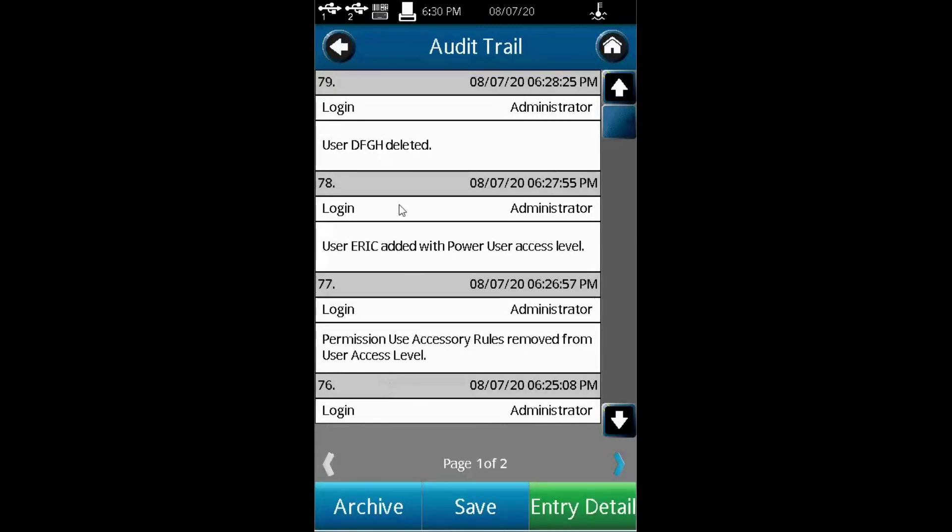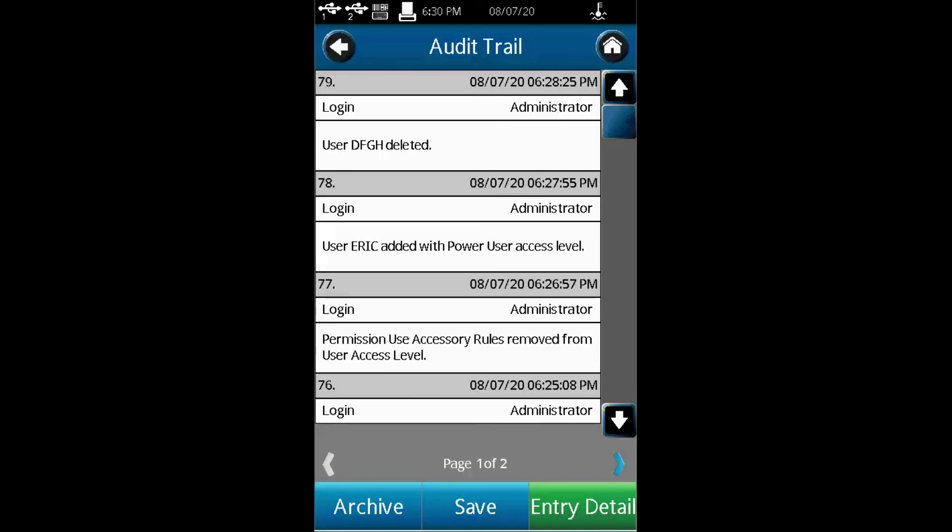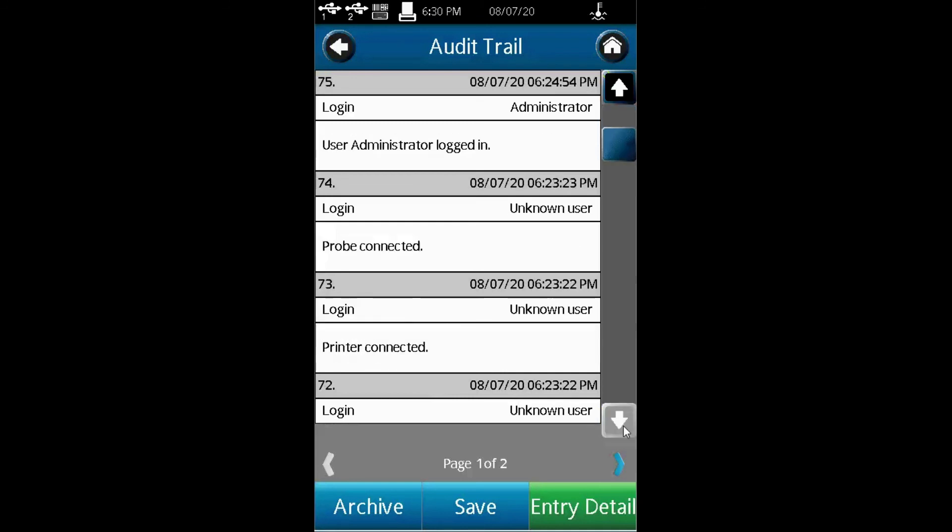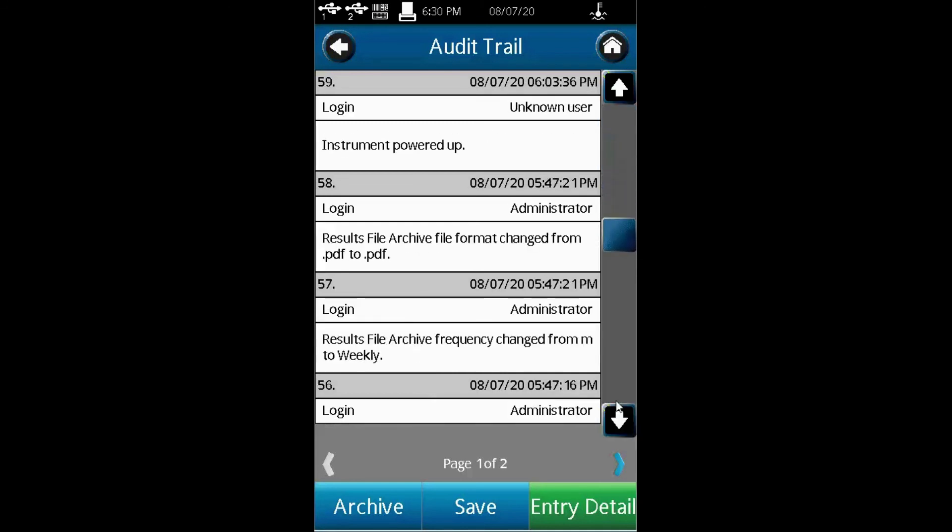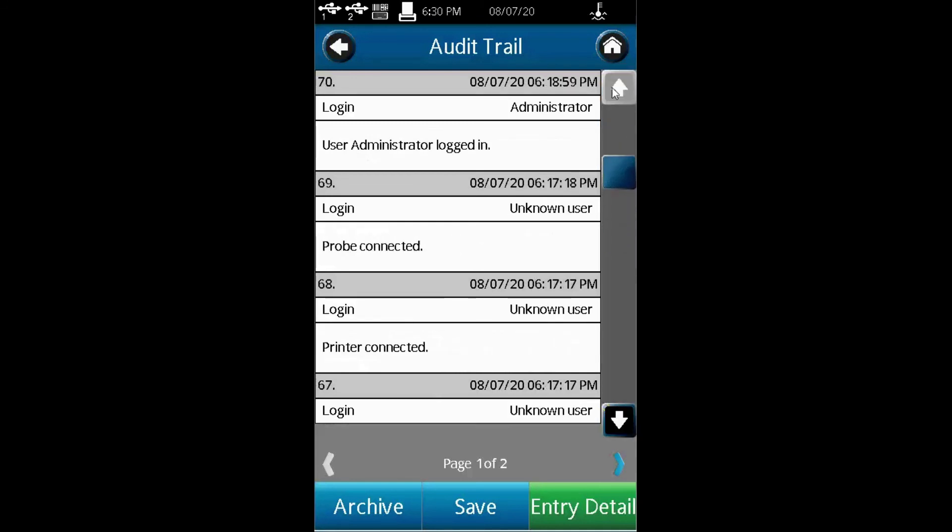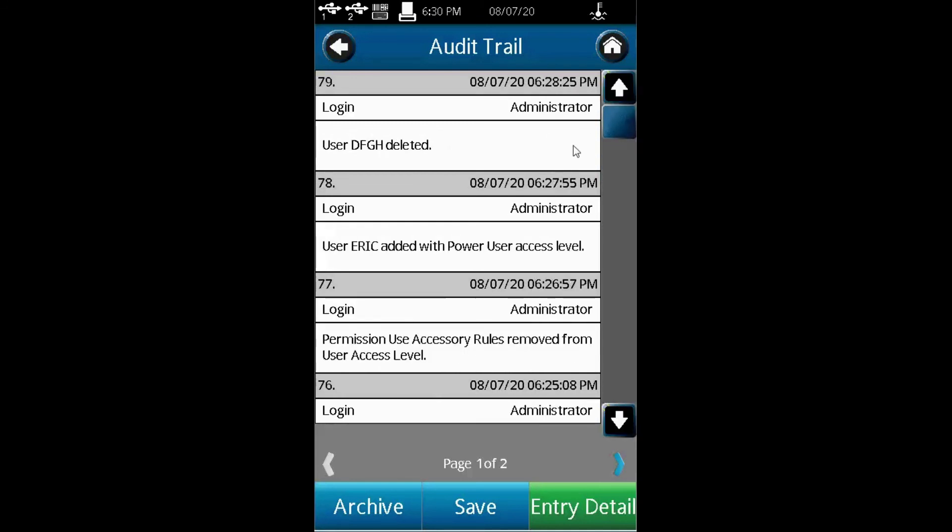And you can see the history. As you can see, Eric has been added. I just added my name Eric as a user today, August 7th, at about 6:27 PM. I also deleted DFGH. The user was deleted soon after. So the audit trail will display what has actually been done to the viscometer. It goes all the way back depending on what you want to see. You can also save or archive the audit trail.